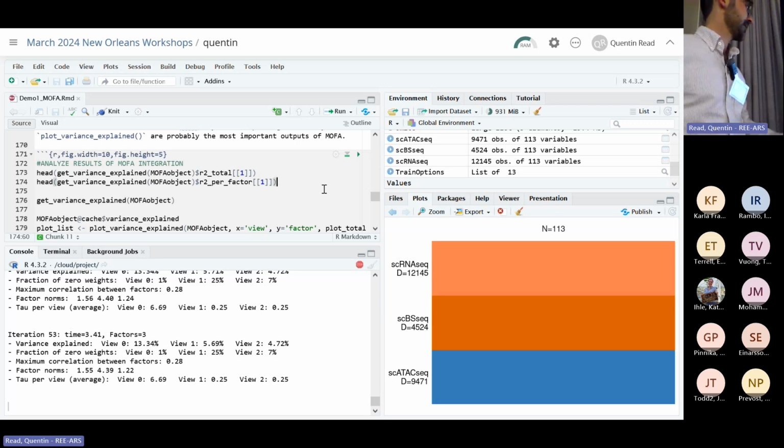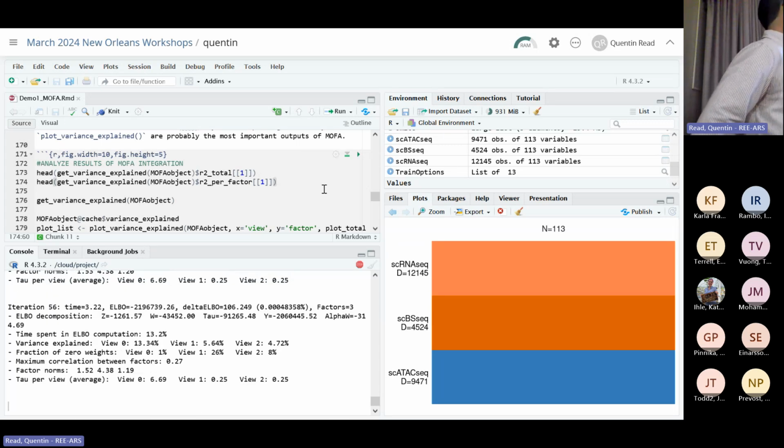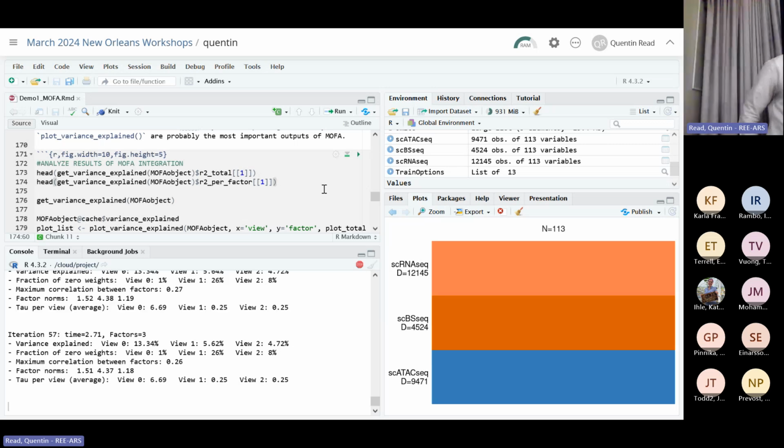Yes, that's right. Thomas is paying close attention to the output of our iterations, and every iteration you can see the number of factors is 3. So it actually has winnowed it down. I guess 20 was a reasonable starting point, but it would have been fine to start with less than 20 because it pulled it down to 3.